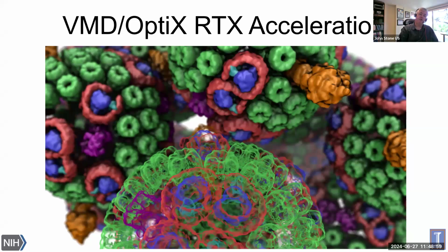With a ray tracer, you can make copies of something, and the rendering cost of drawing another one is negligible. Whereas that's not true for OpenGL. So if you're looking at a vesicle within a cell, and you want a large number of them, this is done basically for free.